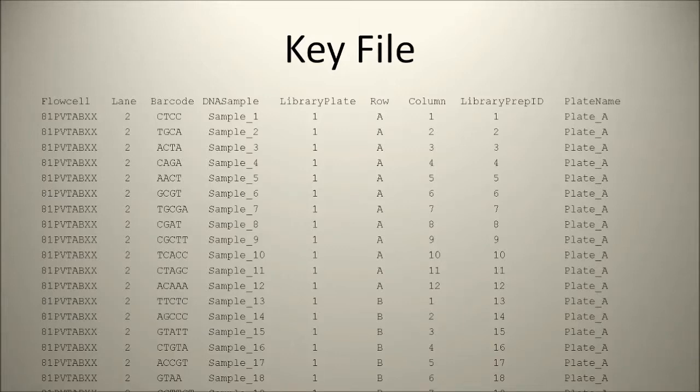And when you're talking about merging, that's a really, really good point. I would merge things that are the same library prep ID. If those are different, something has gone terribly wrong, at the level where you just want to throw out all your data anyway. I always checked if there were replicates on the plate. I always checked that they matched genetically, and I did that as another QC step, but also to see if those things could really be merged, because if it was not the same, it could have been because somebody messed up when they were plating the DNA.